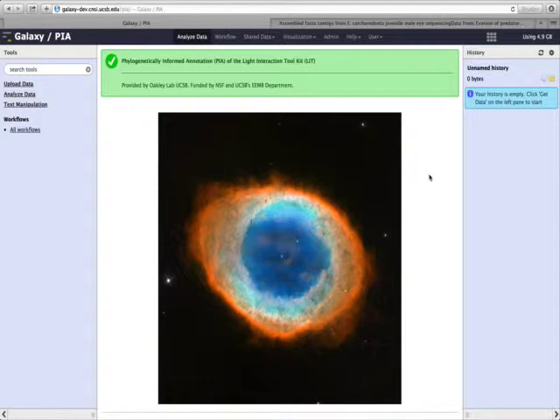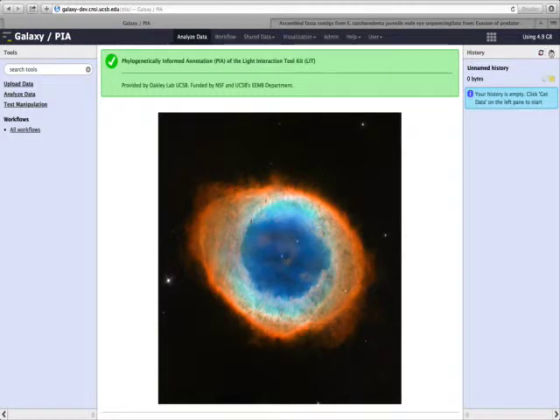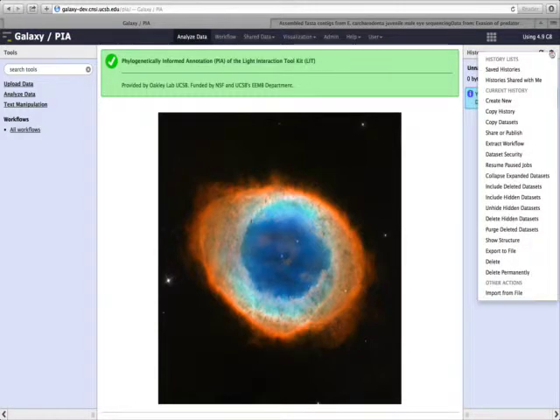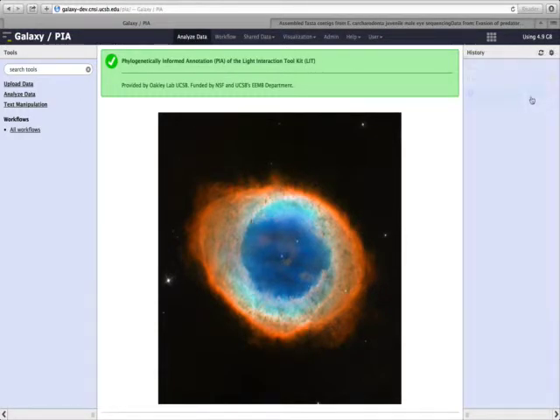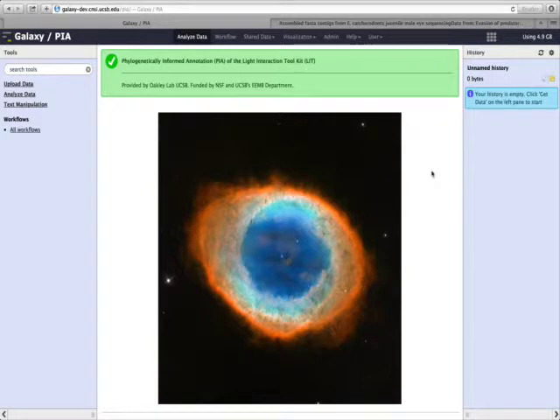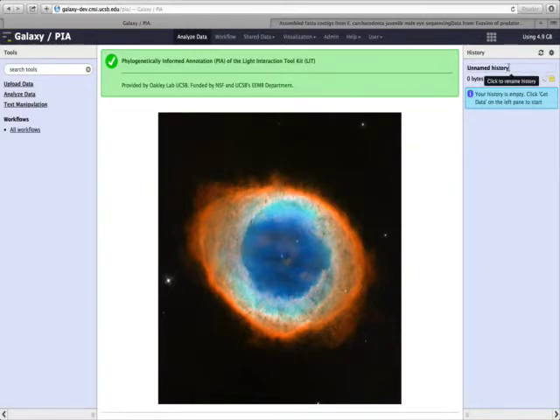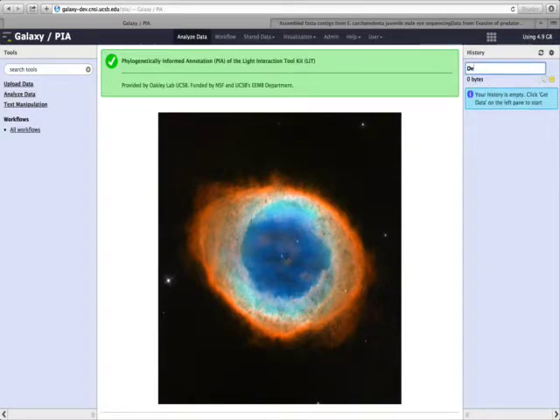The first step is to create a new history. To do that, click on this gear icon, and then click Create New. A history is a record of all the different analyses that you do. We can name the history by clicking on it here, and I will call this Demo.